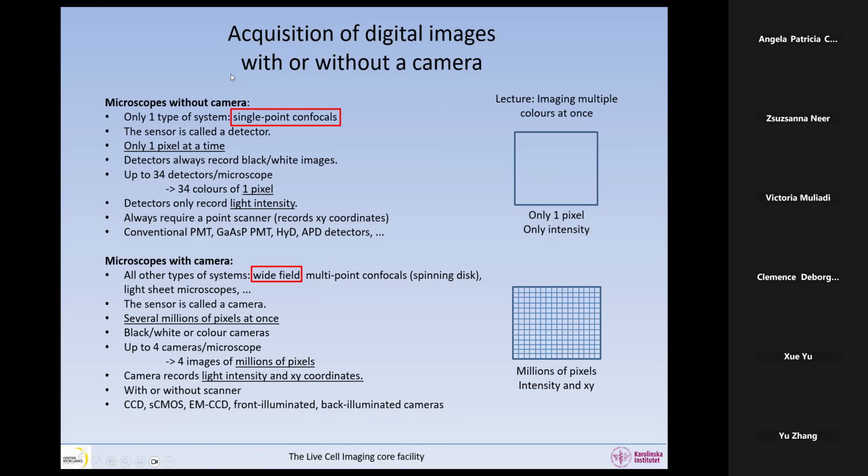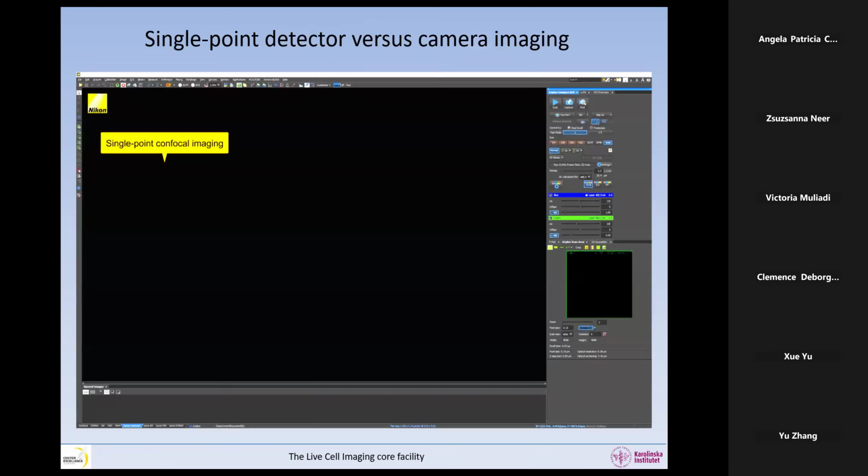Most of you are going to be in a case where you have a single point confocal or a wide field, but I know that several of you this year will image with a multi-point confocal. And so now you know which one has a camera and which does not.